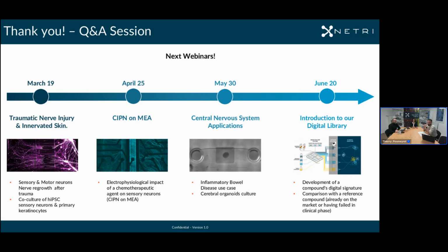All right. I think we have completed the round of questions, but there is a last one. Do you plan to develop platforms containing more than 16 chips? Well, you can answer as well, I guess, on this one. So at the moment, no, because of the way our devices work and the format they have, they are very easy to use and stack within the incubator.